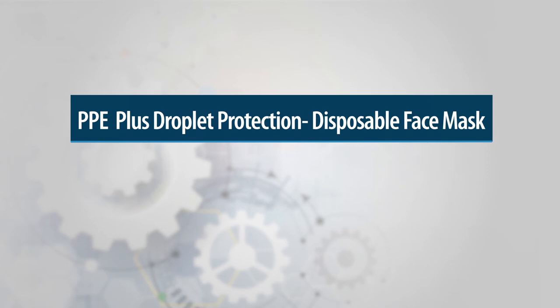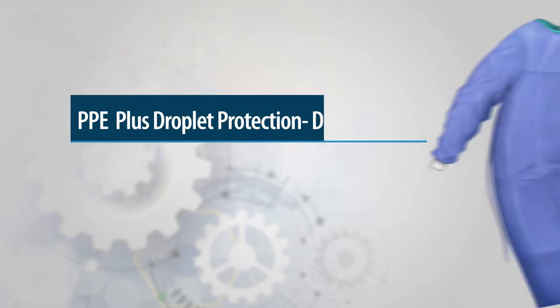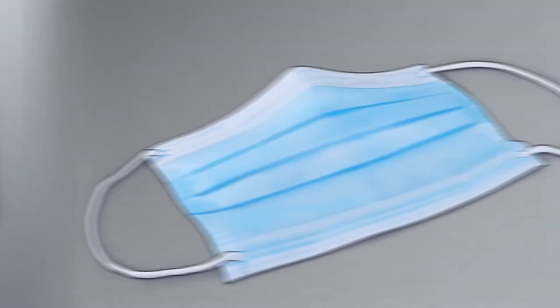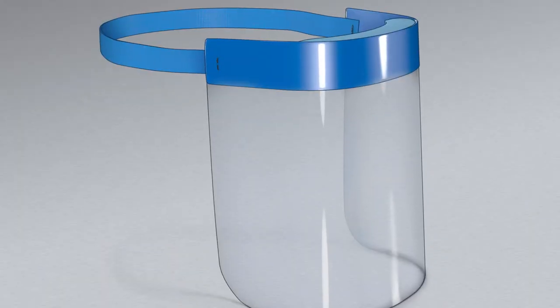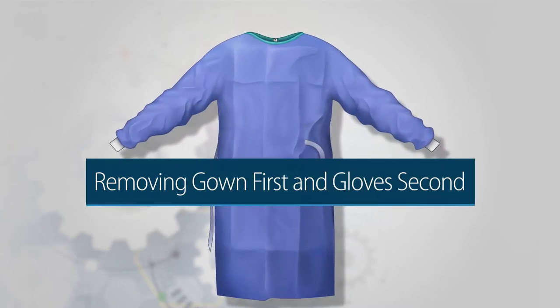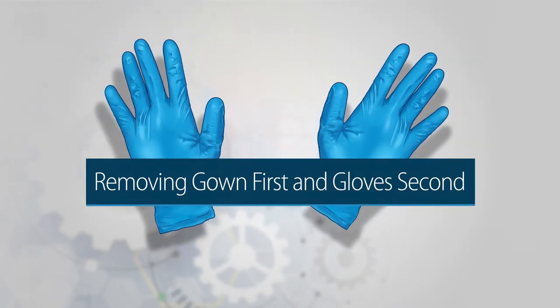This video demonstrates the donning and doffing of the following PPE: gown, gloves, disposable face mask, and face shield. It also demonstrates removing the gown first and the gloves second when doffing.